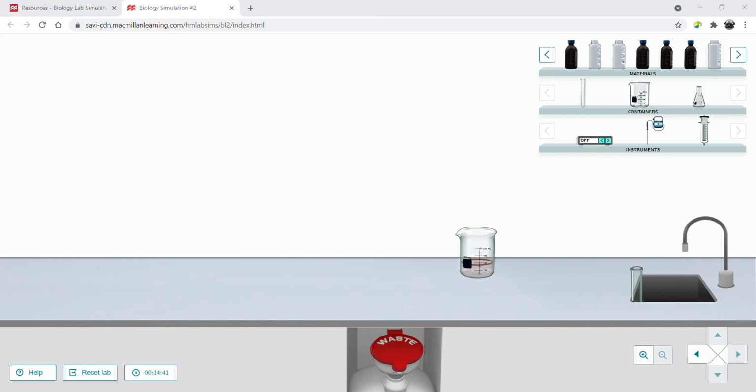So how we're going to do that is, let's get this all set up. You have a table that you're going to fill out, table 5 on page 7. We're going to go through each of these tests, and you're going to fill out that table based on our results, based on what you saw was the negative result and the positive result for each of them. And I'm going to try not to give you the answer because that's for you to determine.